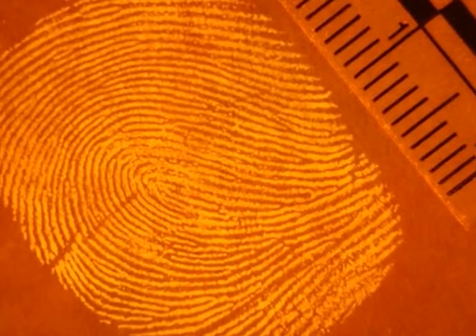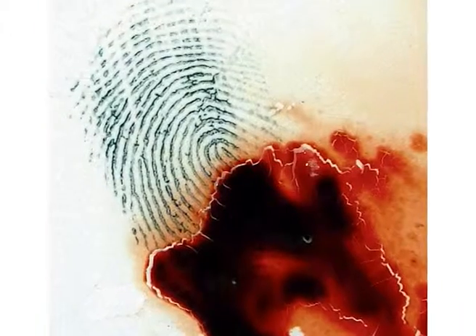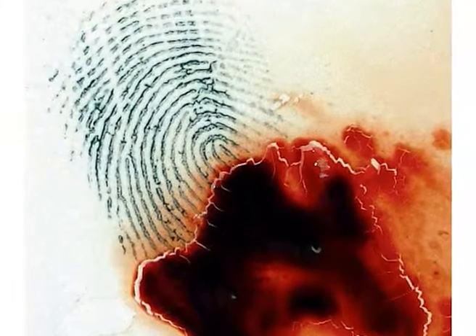A representative blood fingerprint developed by amido black reagent has been shown on your screen. The second chemical reagent that reacts with the protein component is crystal violet. The working solution is prepared by dissolving 0.1 grams of crystal violet, the structure of which is shown in this figure, in 100 ml of distilled water.